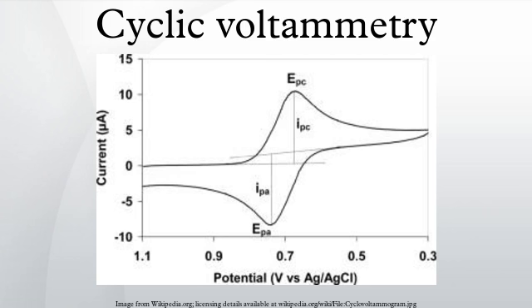Stirring the solution between cyclic voltammetry traces is important in order to supply the electrode surface with fresh analyte for each new experiment. The solubility of an analyte can change drastically with its overall charge. As such, it is common for reduced or oxidized analyte species to precipitate out onto the electrode. This layering of analyte can insulate the electrode surface, display its own redox activity in subsequent scans, or otherwise alter the electrode surface in a way that affects the CV measurements. For this reason, it is often necessary to clean the electrodes between scans.